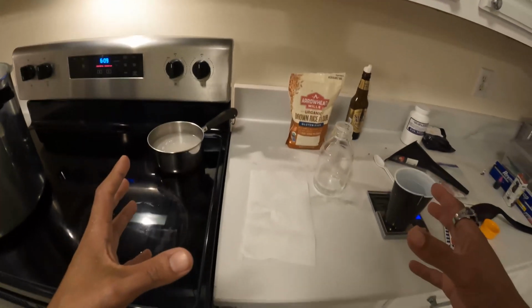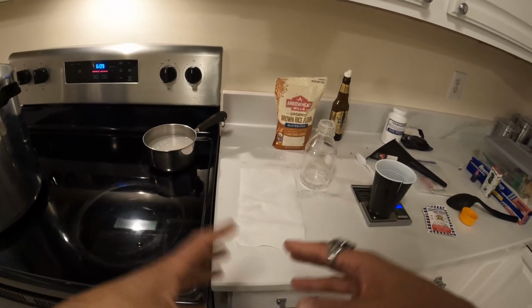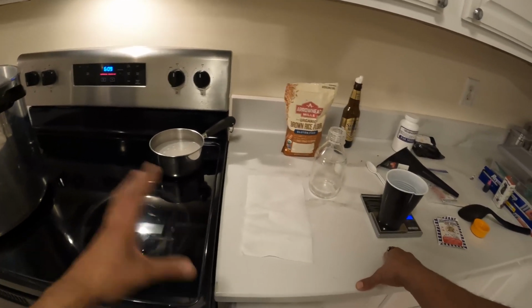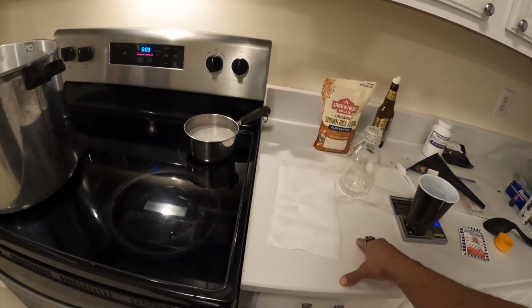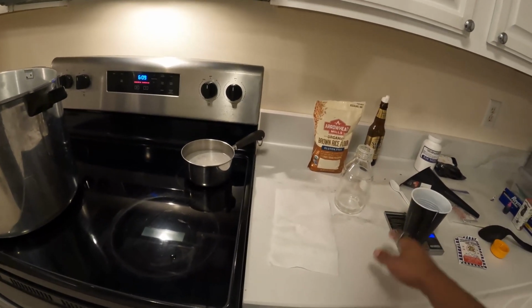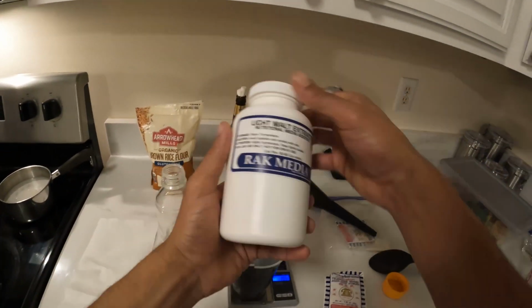There are other recipes such as malt. Malt is the industry standard in mycology, and most mushroom farms are using malt agar plates, which is fine. A lot of species like that. Some species don't really particularly like that, so the growth is not as fast as you would like, or they may even just stall out and not germinate at all. For example, I have some other ones here.